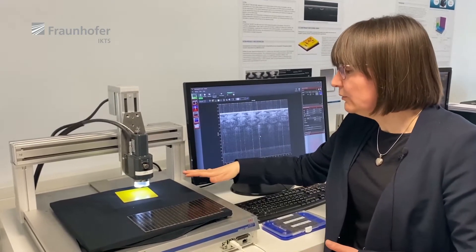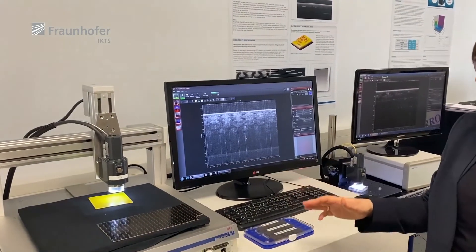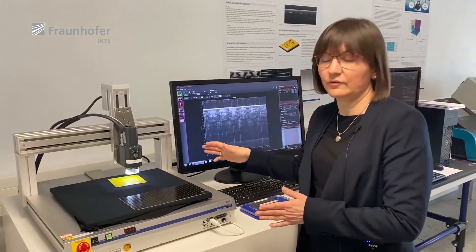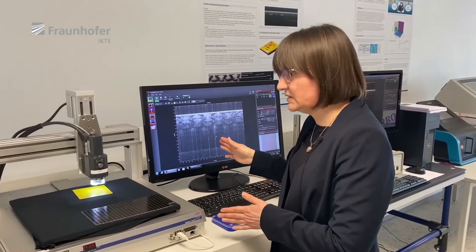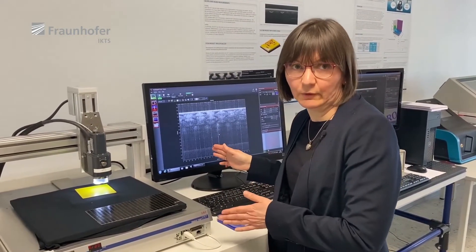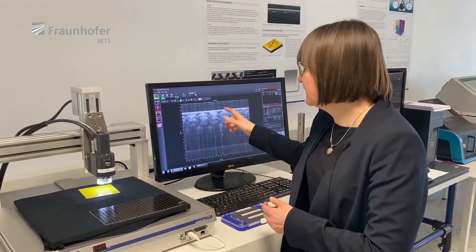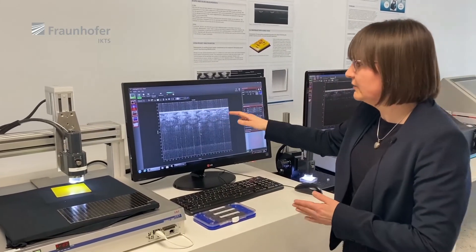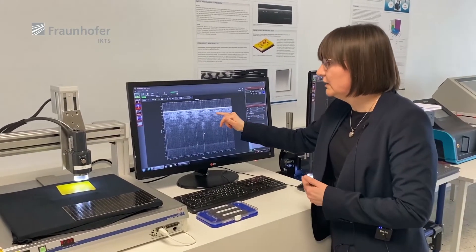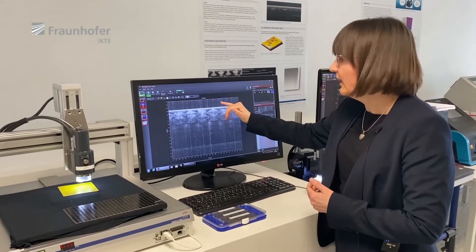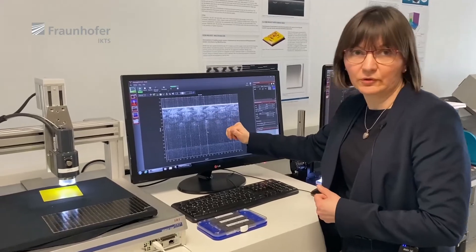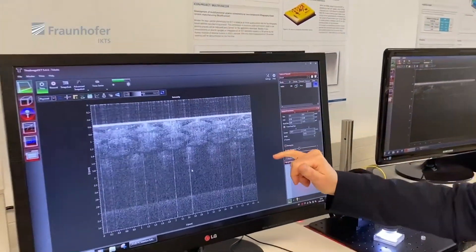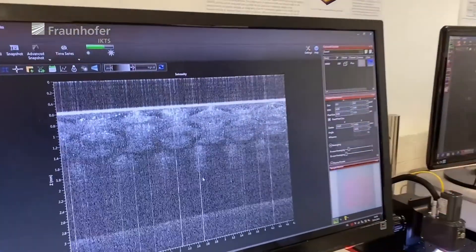Going back to the flexibility concerning the selection of the light source: this system uses 1.3 microns as I said. The depth resolution allows us to see large objects relatively deep into the surface, but we cannot see more of the fine details.